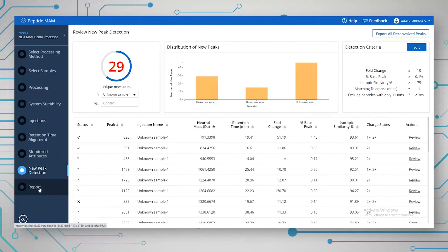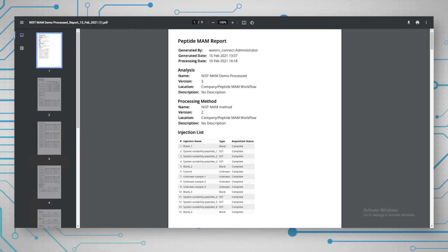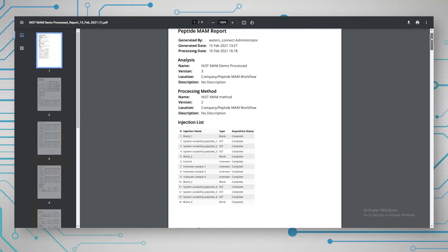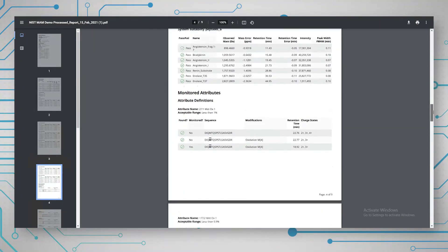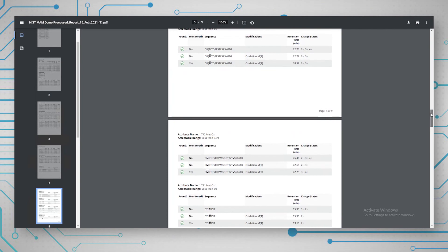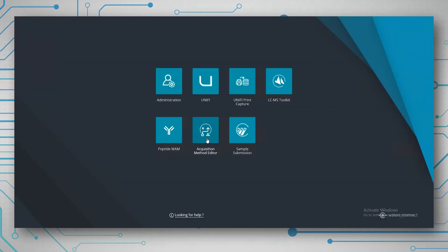The last thing I want to show you is the report. It's quite simple — you have a list of six things you can either tick or untick to include in the report. Once you're happy with everything, you just click 'generate reports' and it brings back a nice report. You can see the SSTs and scrolling down to the monitored attributes, there's a nice summary table with the six different attributes across all the samples. That is the workflow for Peptide MAM — I hope you found it useful. Thank you very much.